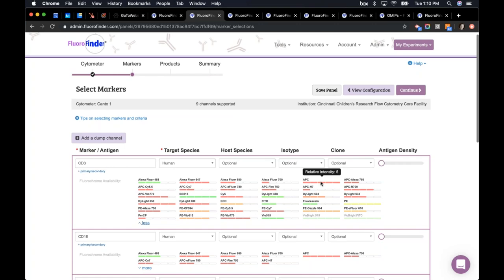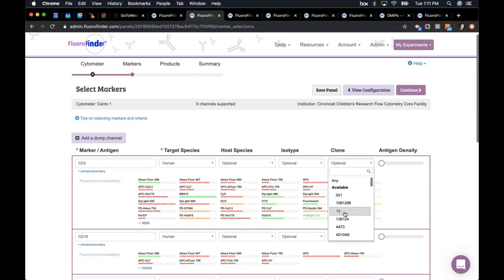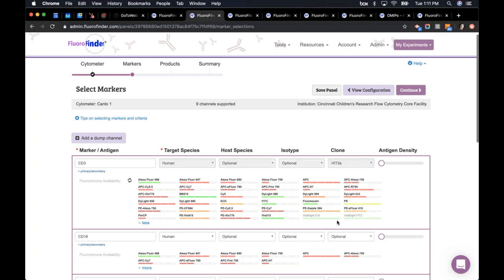You may notice the list of color names and under each one there's a certain number of color bars, which is an indication of relative brightness. APC has five color bars, meaning it's bright, versus Alexa Fluor 700 with a relative brightness of one. You can use the clone filter — for example, selecting HIT3a will gray out colors that don't have a product conjugated with that clone, so you'd only see HIT3a products on the products page.